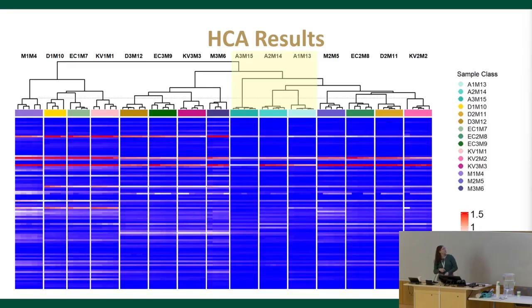And looking at the heat map, we can start to maybe understand why the volatile profile was so different for the Abbey yeast than it was for all of the other yeast strains. It seems to contain maybe similar volatiles, but definitely in lower relative abundances. So that might start to explain the separation of that strain of yeast from the other ones.